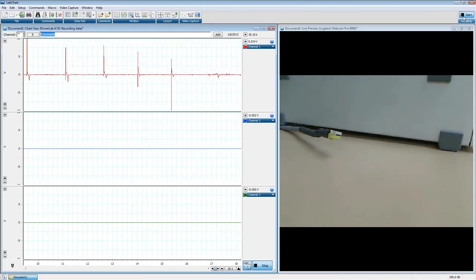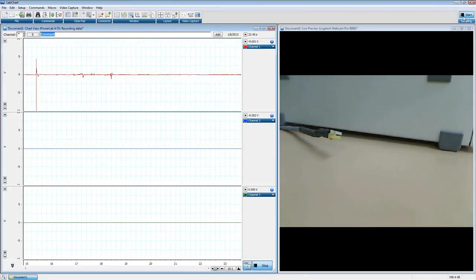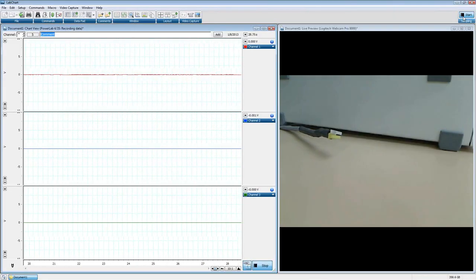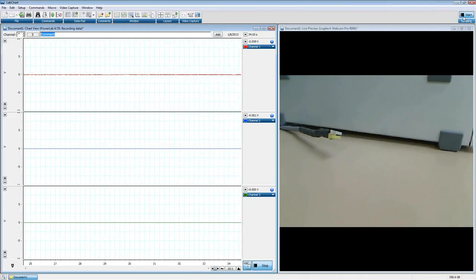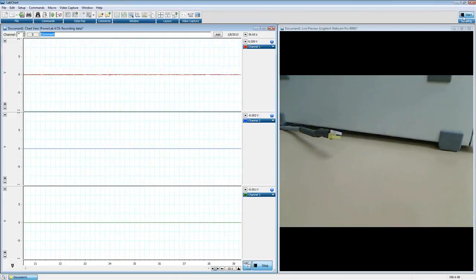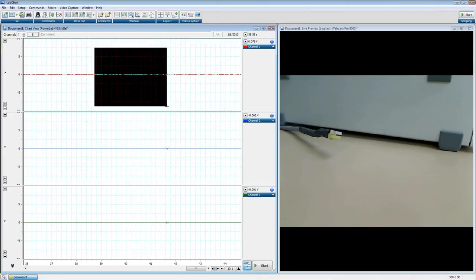So those are the basics of digital inputs and outputs, Event Manager, fast response, and communicating with other devices in your lab and kind of bringing their inputs into LabChart, into the data, marking it, or actually telling LabChart when certain conditions are met to tell the PowerLab to send out a TTL pulse to signal another device to either take an image, to inject a certain volume, things of that nature. So it's a great way to automate your lab and kind of bring everything central to LabChart, so you don't have to do a bunch of different setups. Everything can be here in a LabChart file, in a settings file that you're going to use every time, or just for you to create on the fly.